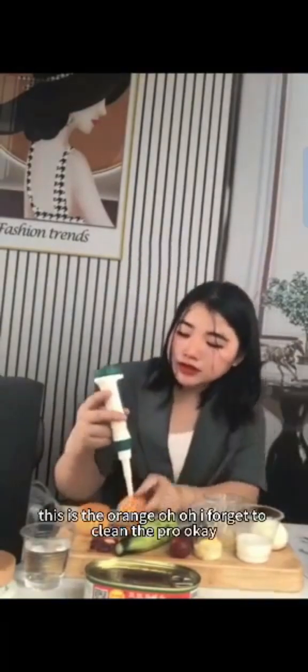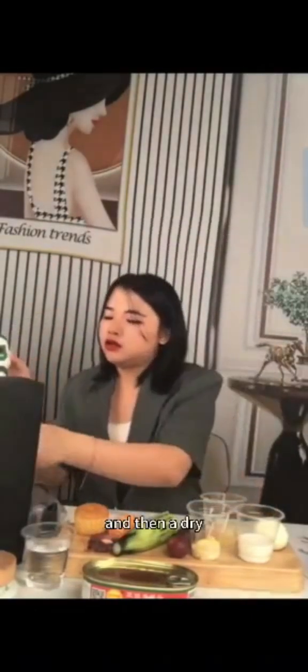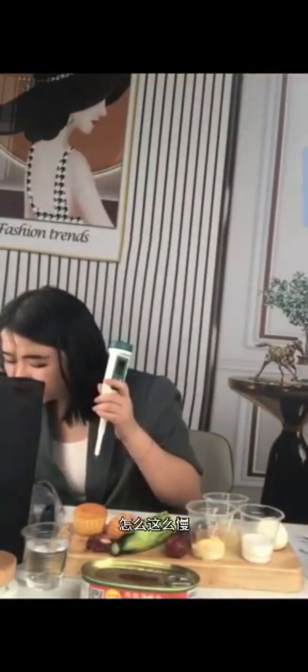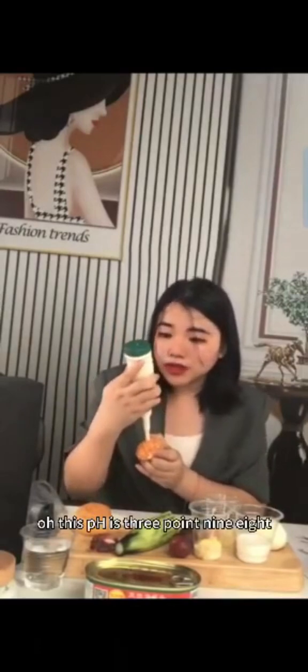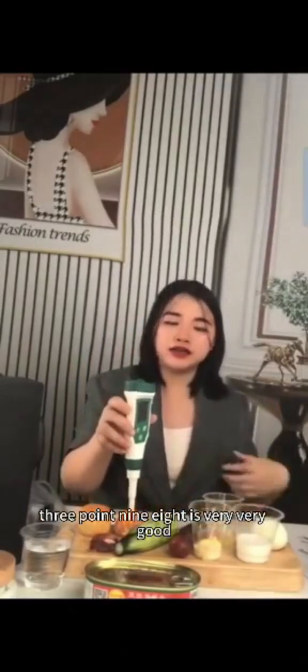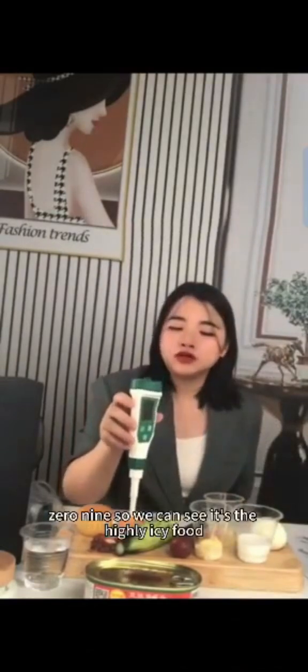This is an orange. I forgot to clean the probe, let me clean it and dry it. The pH is 3.98, very good — it came to 4.09.